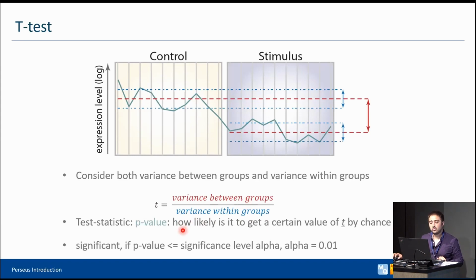So there is a whole mathematical model around it, and then you do some distribution, do some fancy things, and this is the part where it's a little bit subjective, and you have to define what is significant for you. And normally significant is given by a p-value that is small enough, normally 0.05 or 0.01, depending on how strict you want to be. And one could say, okay, this is really the end of it.